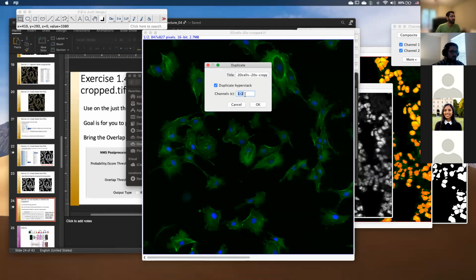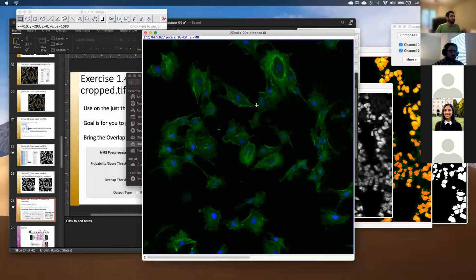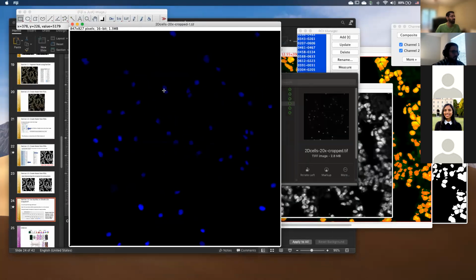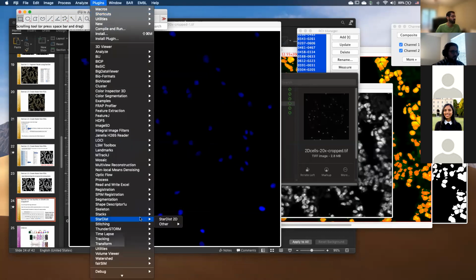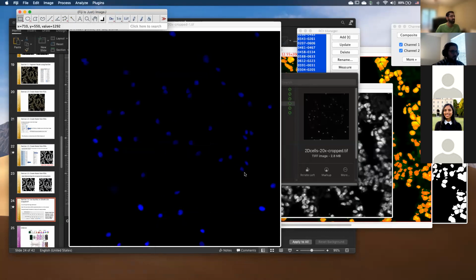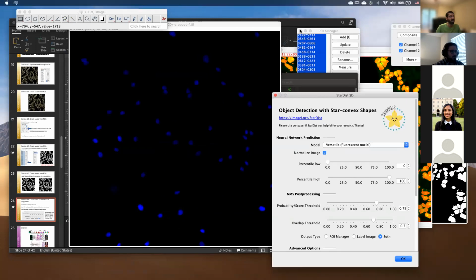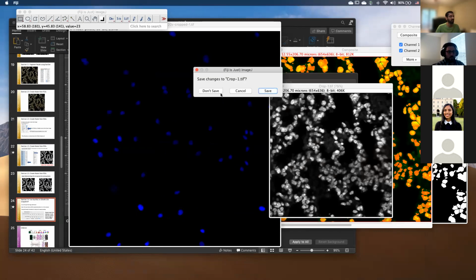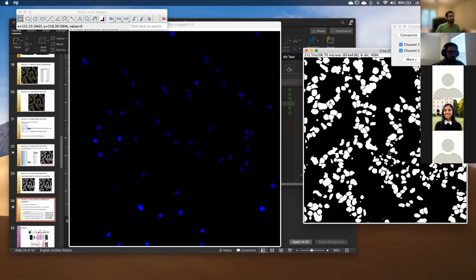So I'm gonna use my first channel, say, okay, this is all I care about. And on this channel, we have got some nuclei which are bright, some nuclei which are dim. So I'll go ahead and again use my StarDist plugin. The point I want to make is what happens. Let me close my ROI manager first. And if you have your ROI manager open, go ahead and close that.